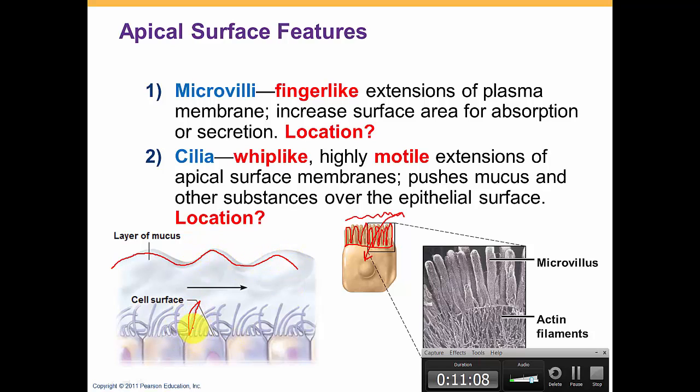This is our cilia here on top of the epithelium. These move the mucus towards the outside. So if any bacteria come here and get stuck to this mucus, or any viruses or any dust, our cilia will push them out, so you can either spit it or swallow it.